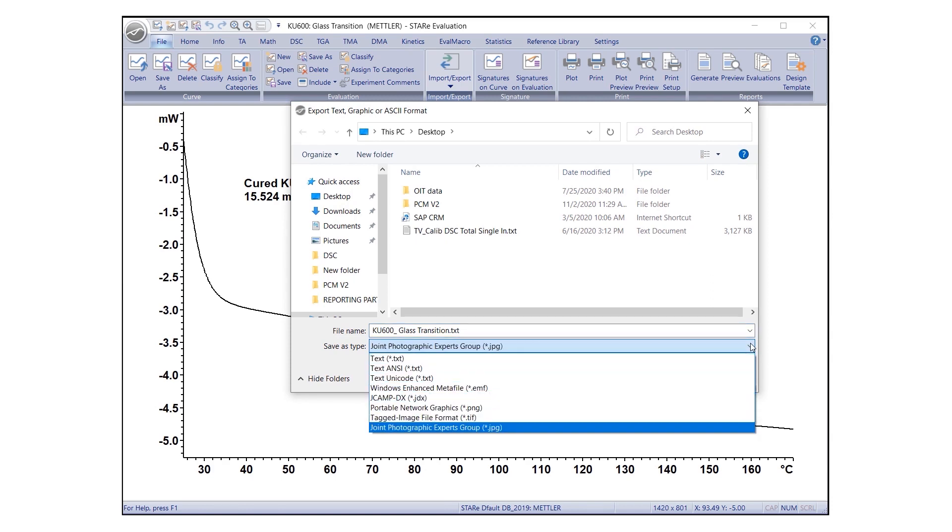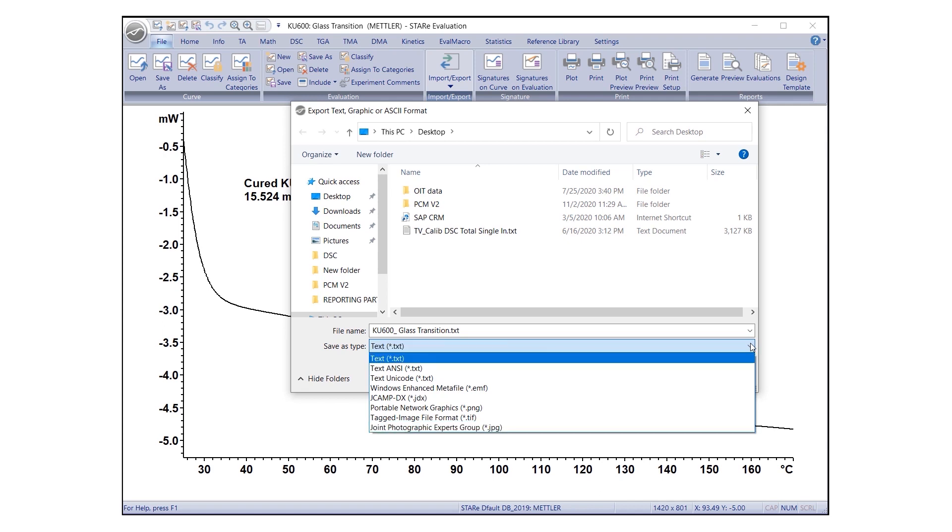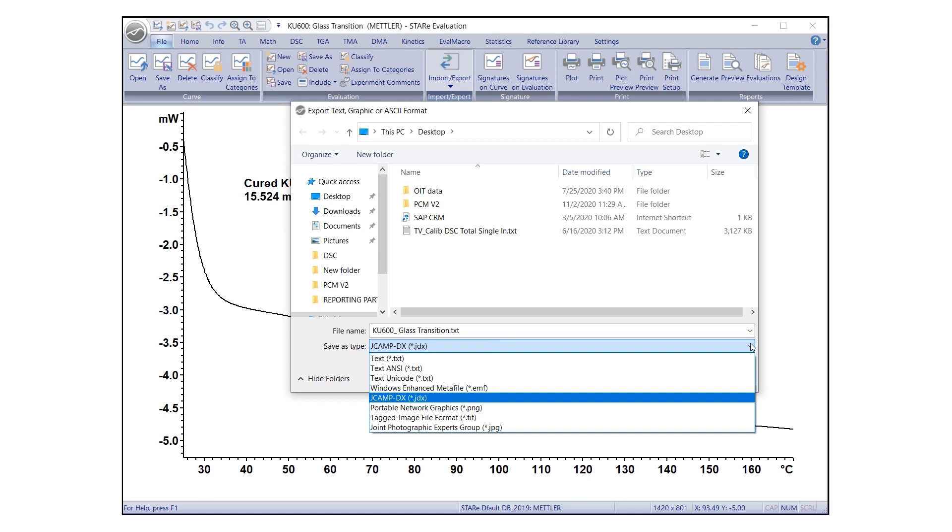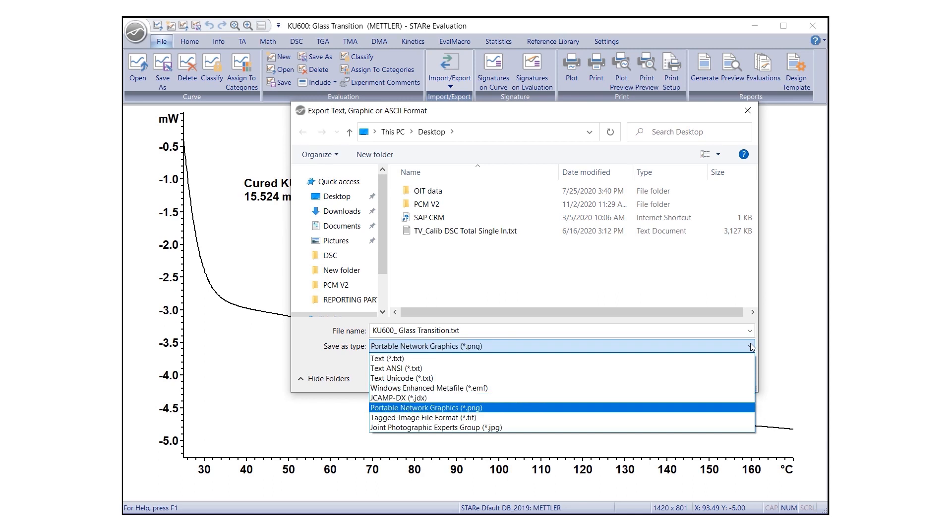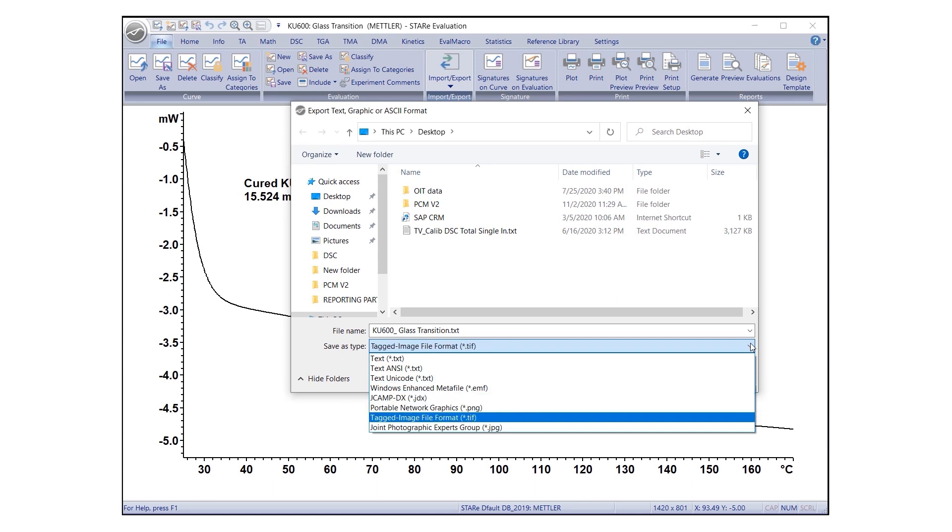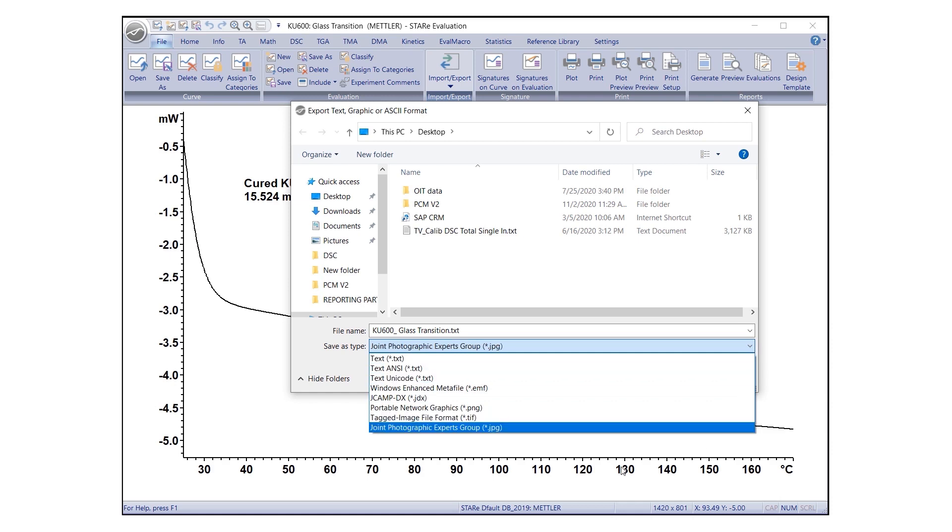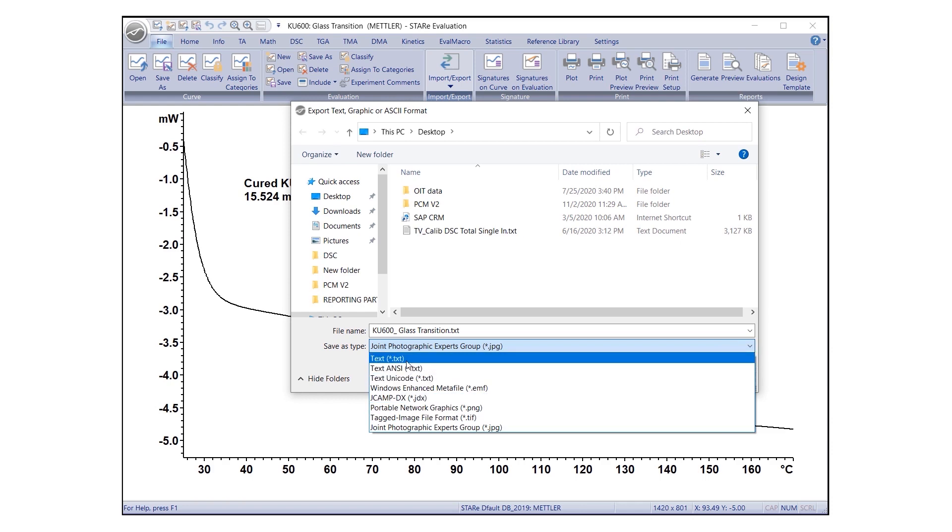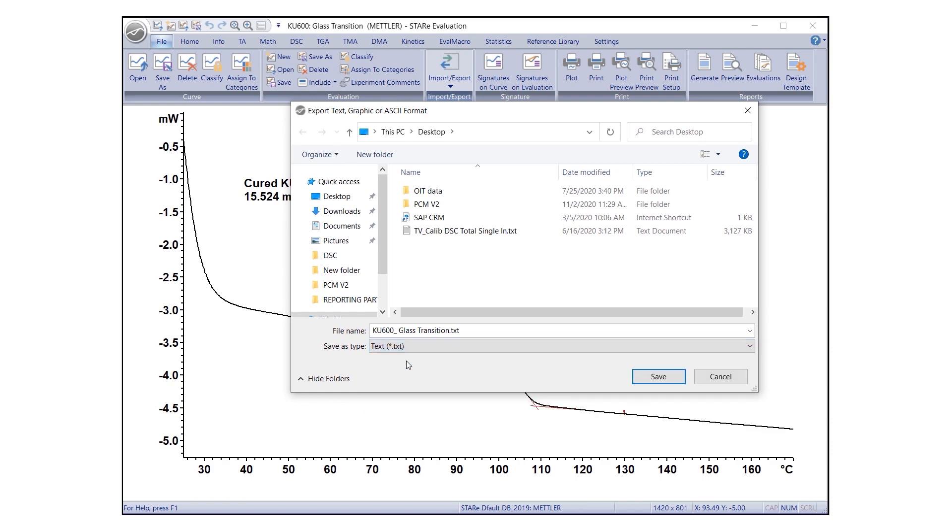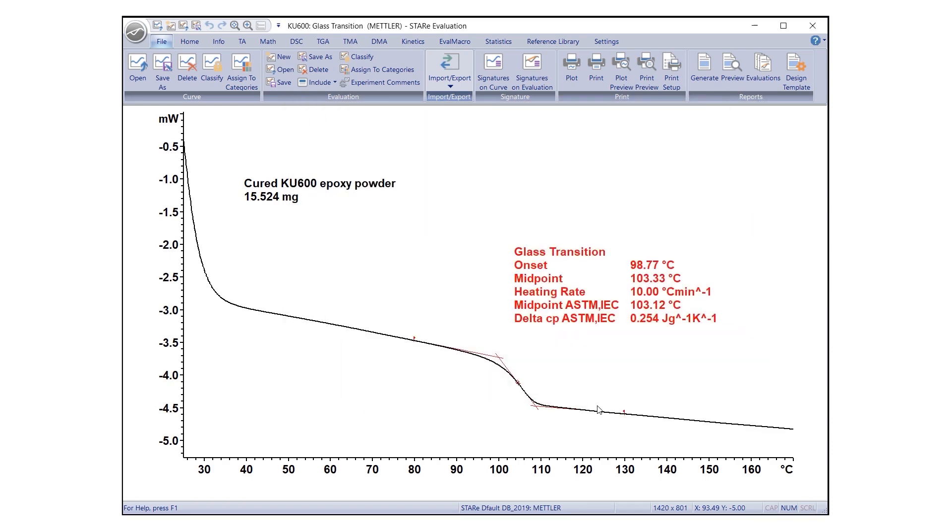Select the type of file to be exported in Save as Type. The available formats are .txt, .emf, .jdx, .png and .tif. If selecting Text Format for export, the settings defined under Print Export are applicable. Click Save to complete the export.